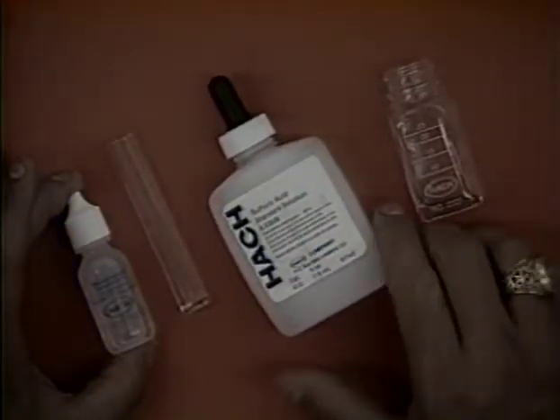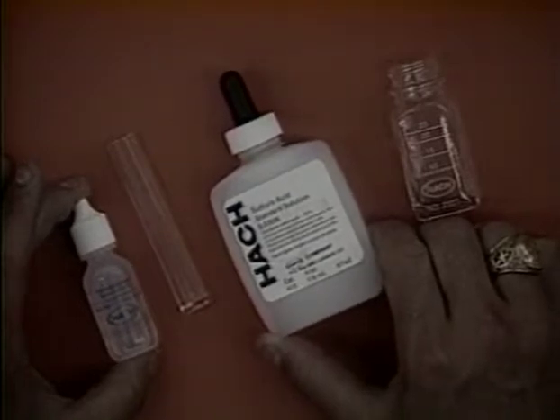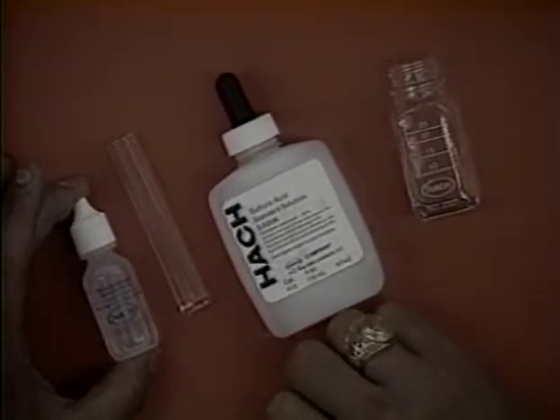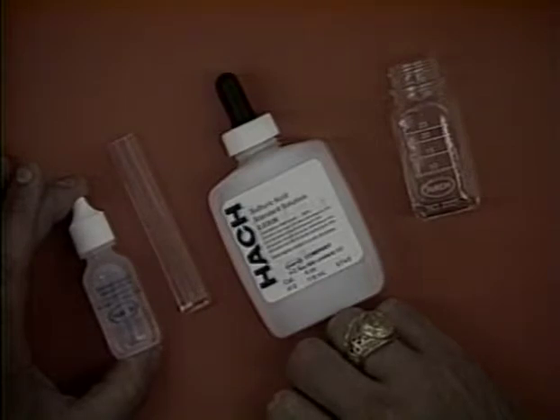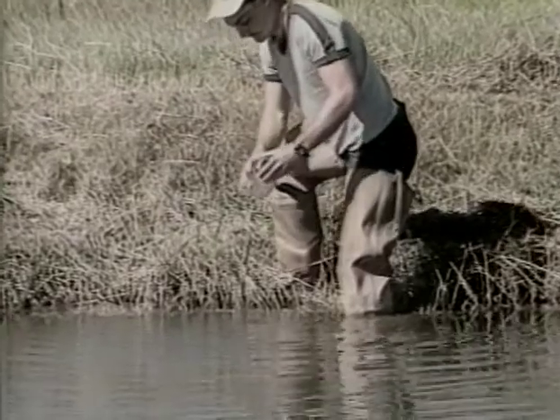Included in most test kits are a high and a low range test for alkalinity. Initial testing of alkalinity should start with the high range method. To use the high range test, proceed as follows. First, obtain a sample of water to be tested.